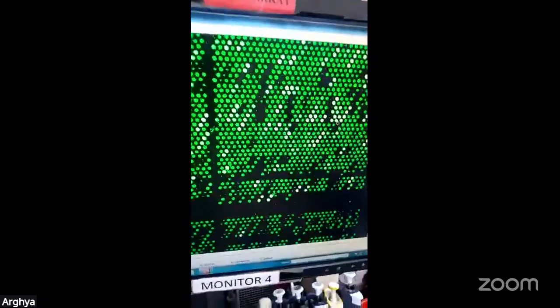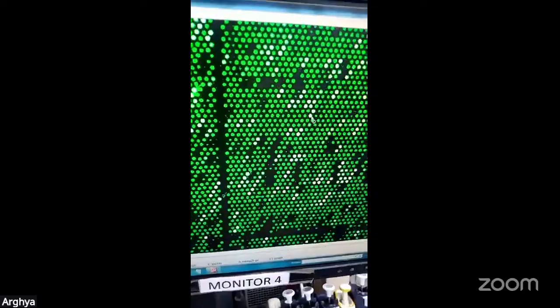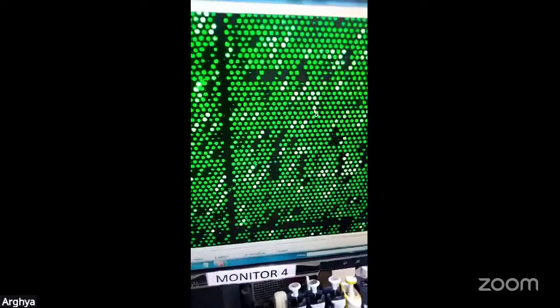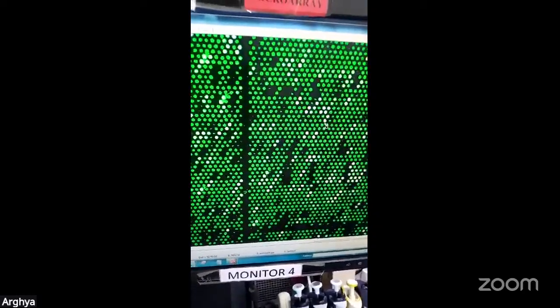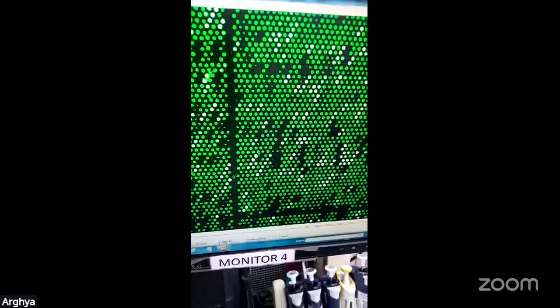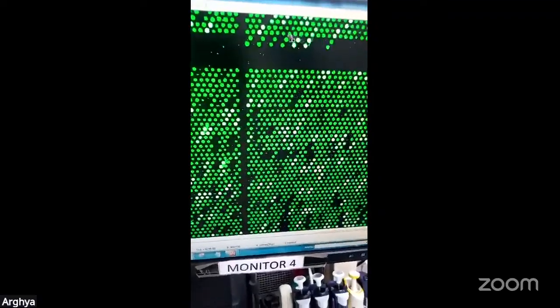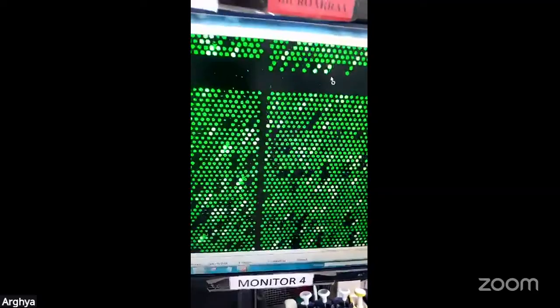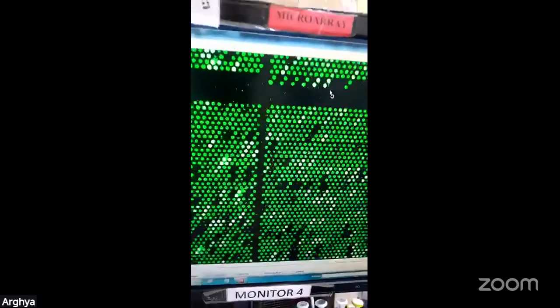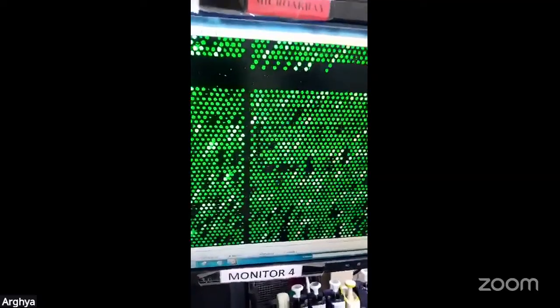You have to optimize all these protocols. Like you see, at each protein spot there is oversaturation. You have to find the optimal wavelength at which the spots are clearly distinguished, and all these protein spots are represented. These are the GST spots, which indicate the increasing concentration of 10x, 20x, 50x. You can use this for the quality control for the green channel.